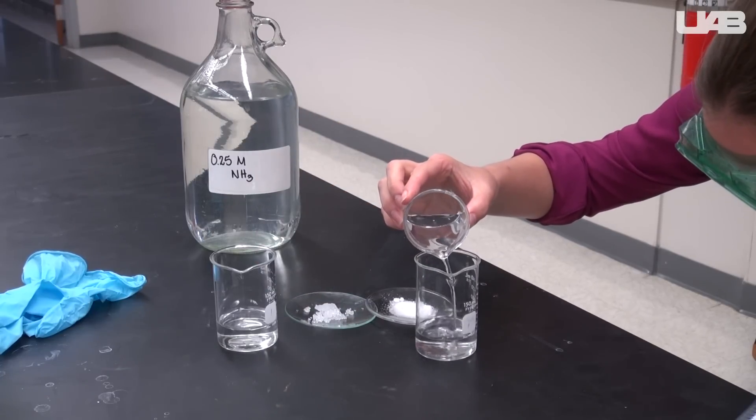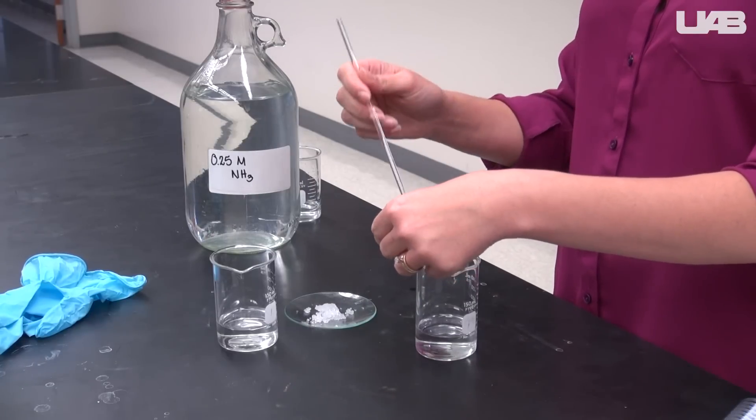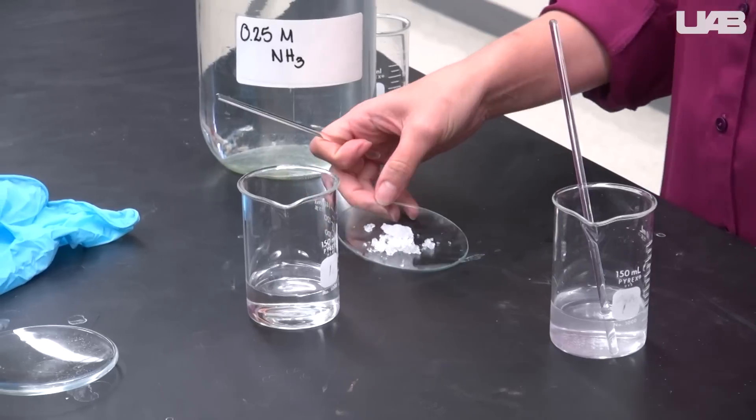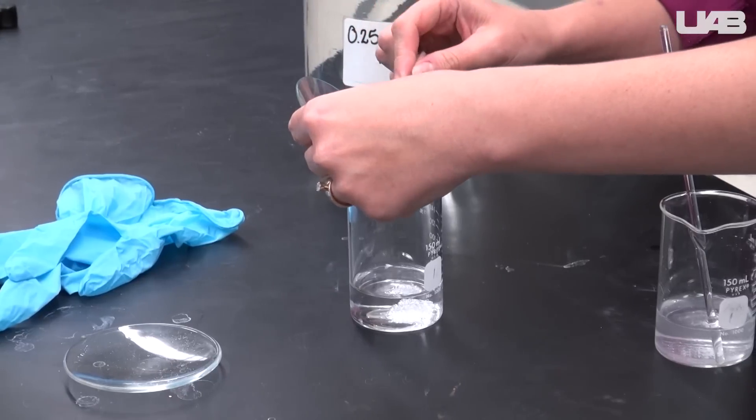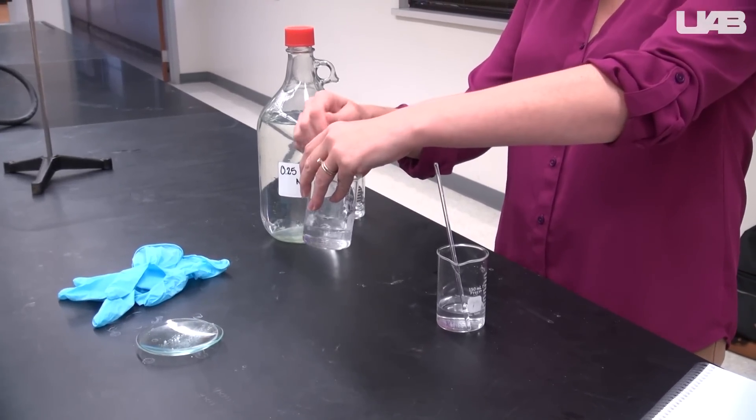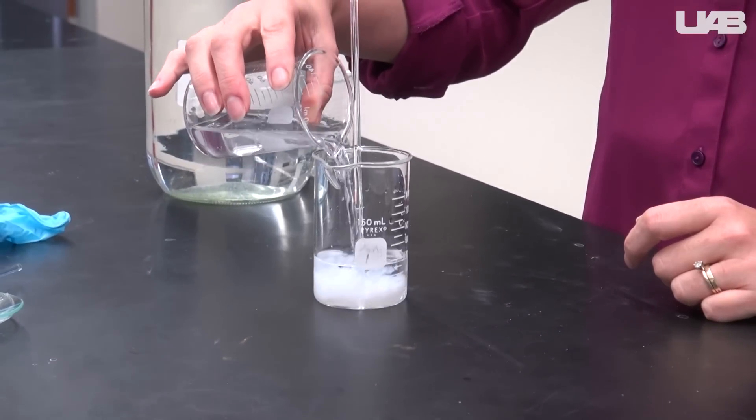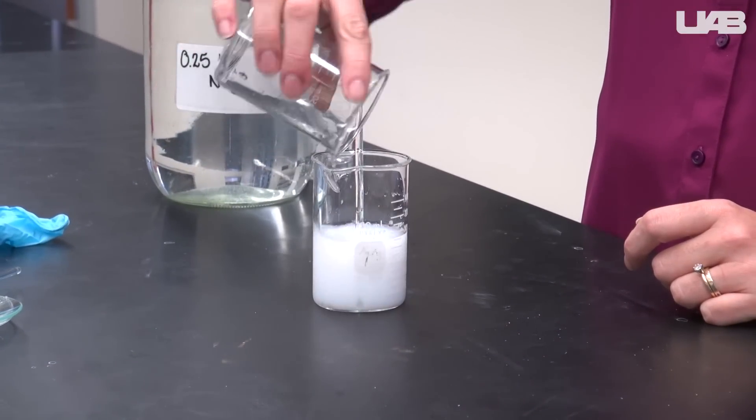Pour half of the ammonia in one beaker and use it to dissolve the di-ammonium hydrogen phosphate. Pour the other half of the ammonia in another beaker and use it to dissolve the calcium nitrate. Once both solids are completely dissolved, mix the contents of both beakers together. A precipitate will form.